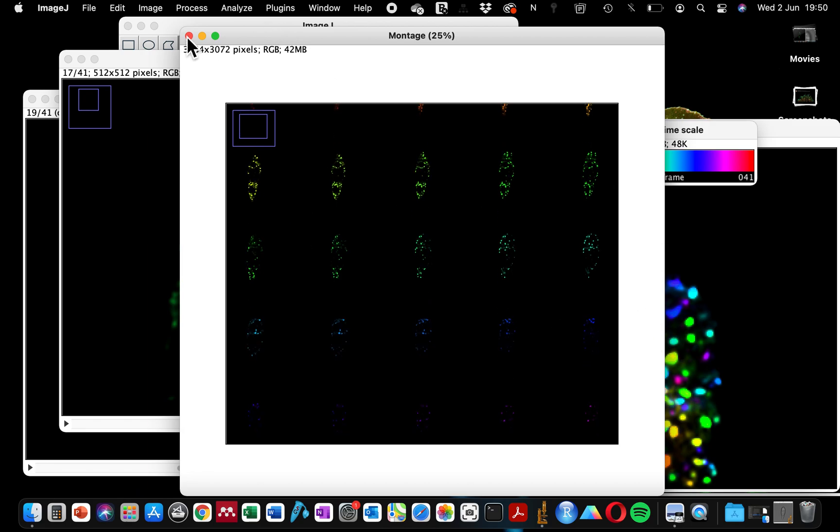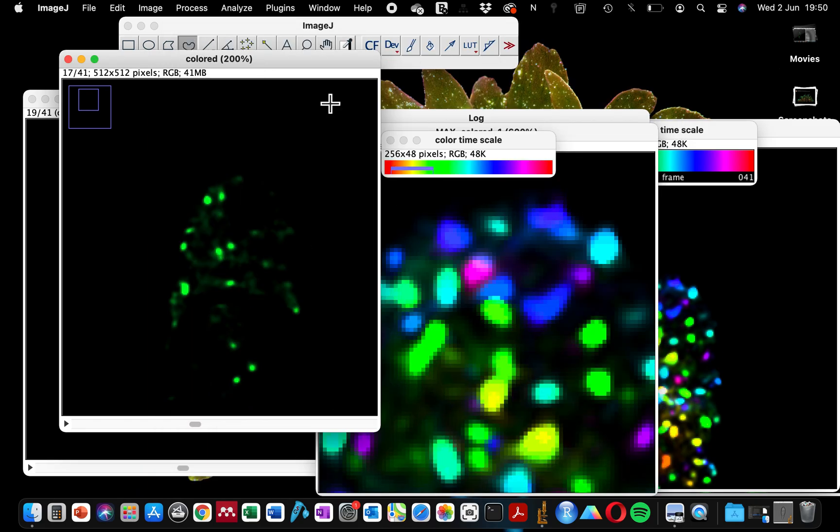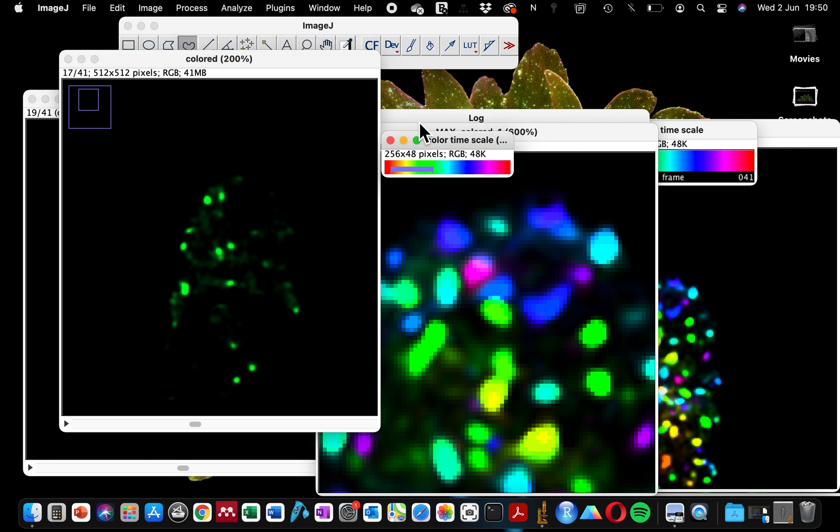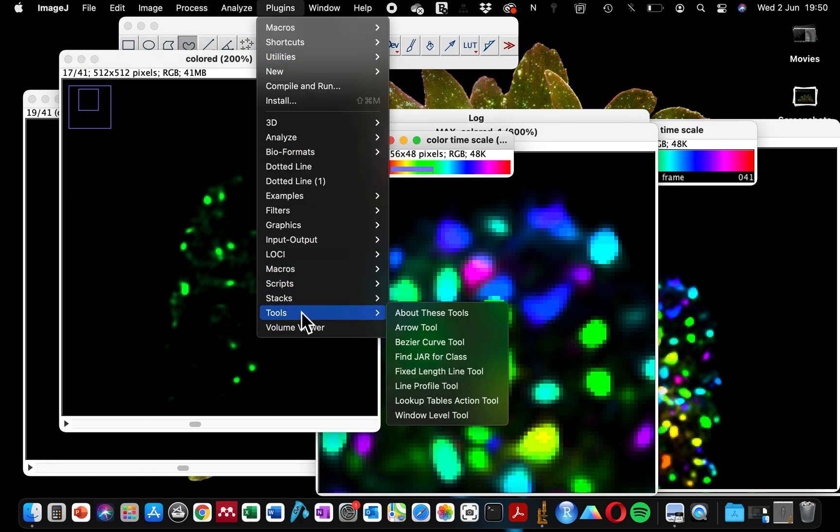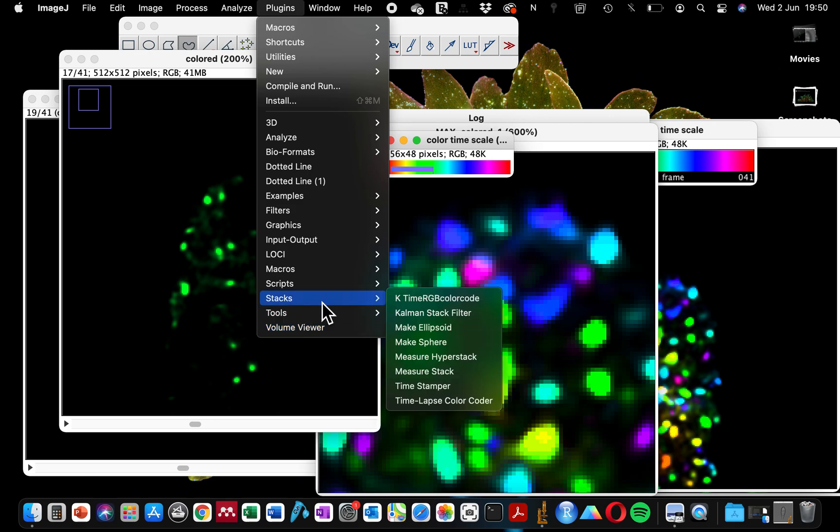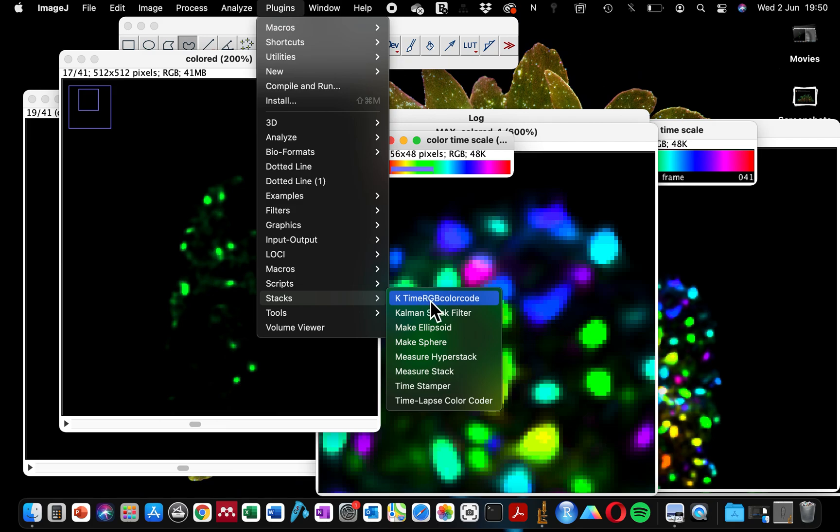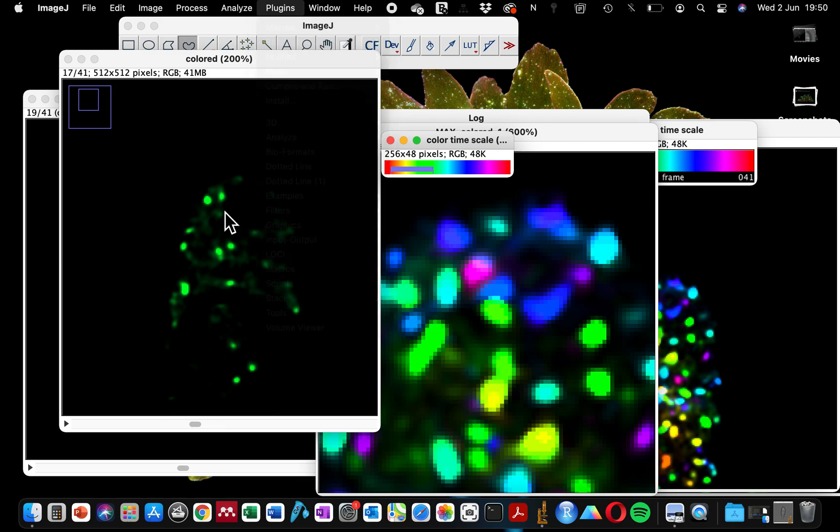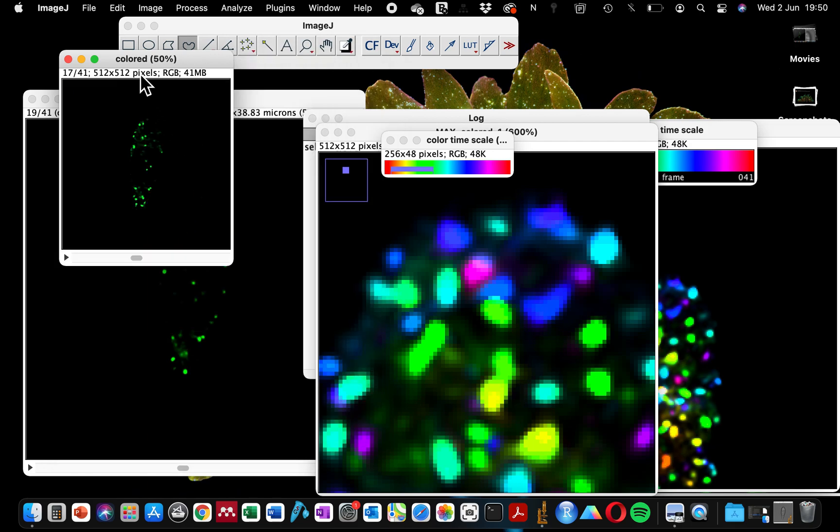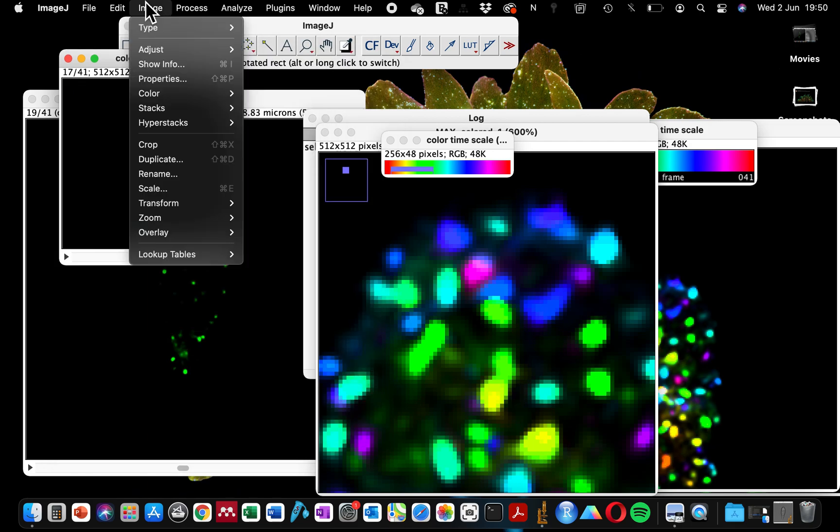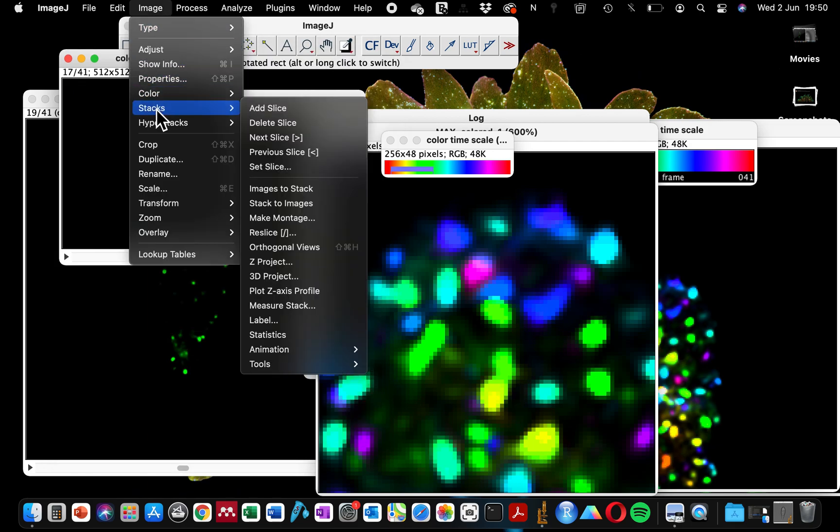That's the extra function that this function has. If you do not need the extra information, you can just use the Timelapse Color Coder, or use this. If you have this one, it's nice because you can still make a maximum projection from it just by going to Image, Stacks, Z Project.